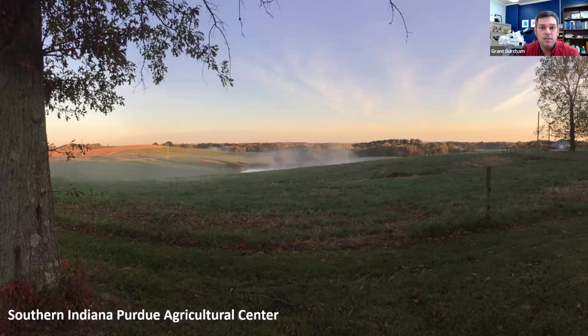And then we've got a lot of support staff too that are up front talking to clients, bringing samples in, getting samples labeled appropriately and where they need to go, and cutting slides for us to look at those biopsies. So there's a lot of moving parts to it, and for what the lab is, we do a lot with the folks that we have.